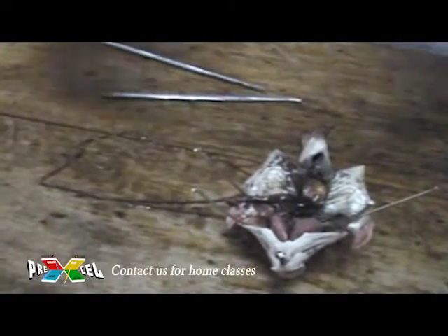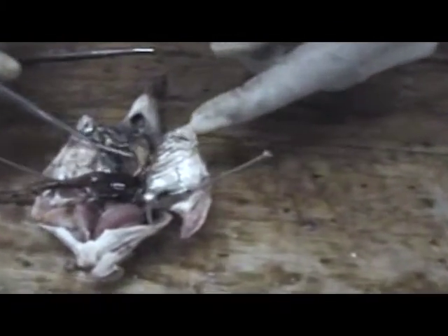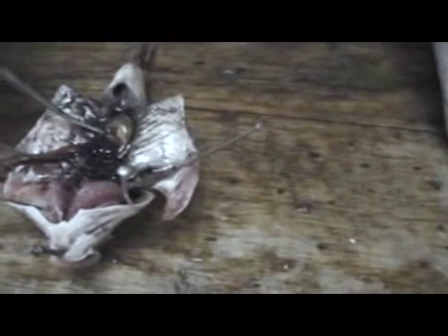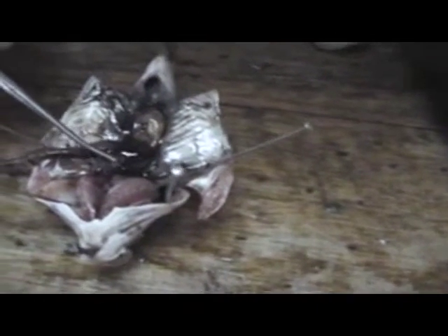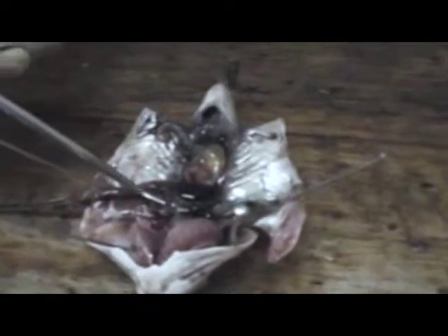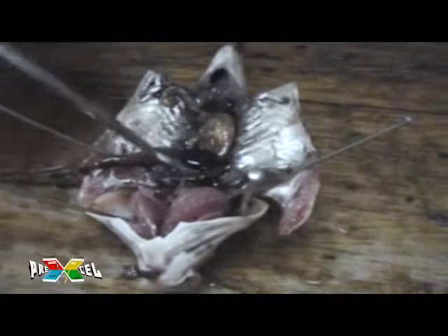Here is a display of the intestines. This is the stomach that comes down, this is the liver here. You can see a small spleen here — this small part here is the spleen. Let me add some water. This is the spleen, and this is the stomach, this is the liver.